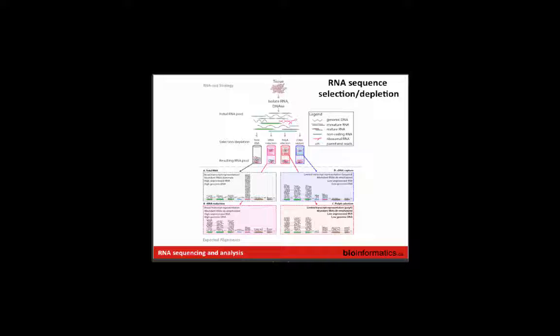Poly-A selection does that even more, and you get a cleaner result. More of your reads are focused on the exons. You have fewer intronic reads, fewer intergenic reads. And then cDNA capture has a similar effect, but allows you to achieve that without doing the poly-A selection, so you don't have to worry about introducing this end bias.